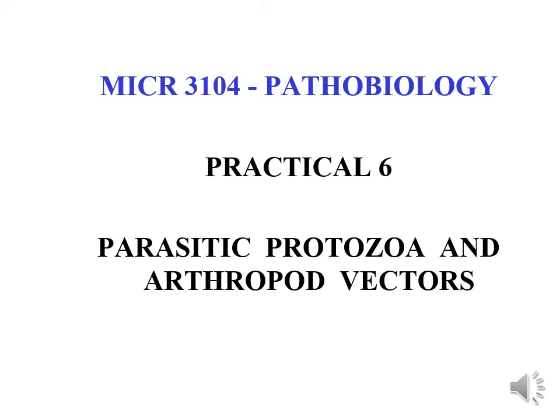I just want you to be more relaxed about today's practical, and we have another practical, which is practical 7. Usually, even when the study is normal, we used to have what we call a dry lab. That is, we introduce the practical, we make a PowerPoint show discussing the different slides and photographs of the parasites, and then you'll find those parasites demonstrated under the microscope. So we examine them by microscope.